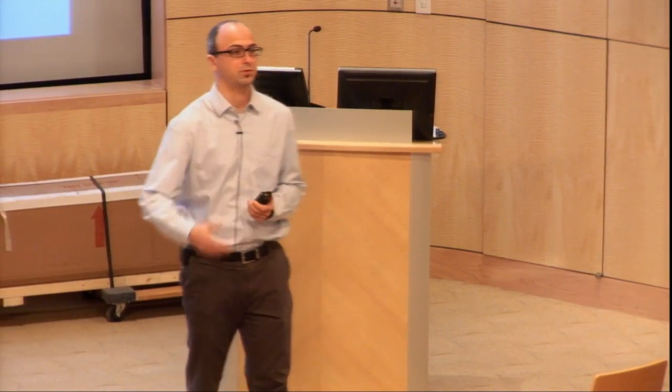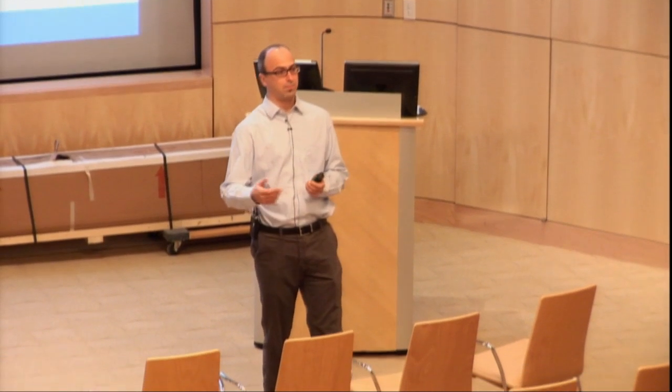And so now I'm going to talk about how we're putting together all these things that we've learned about so far to do a quantitative proteomics experiment, because we're not just so interested in a list of proteins, we're interested in how these proteins change in biology.